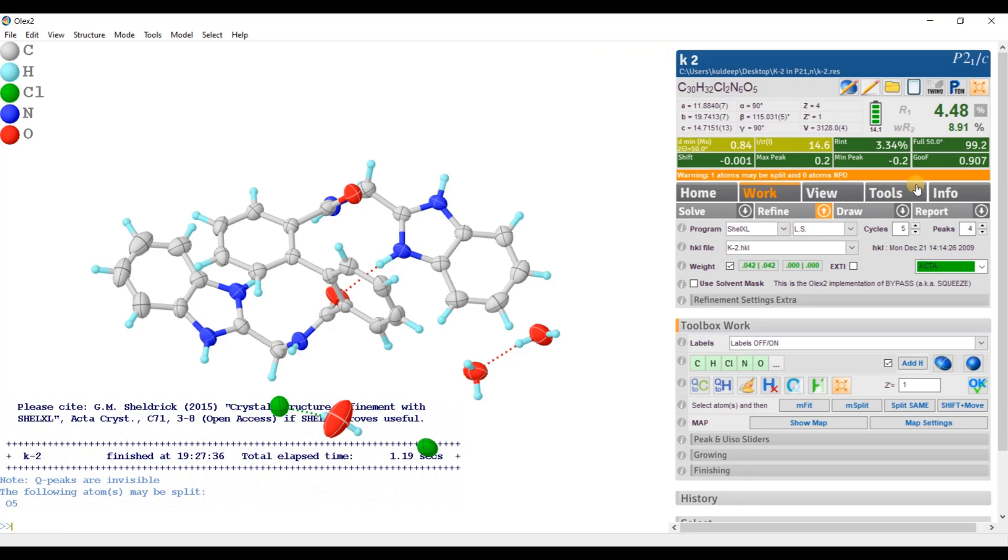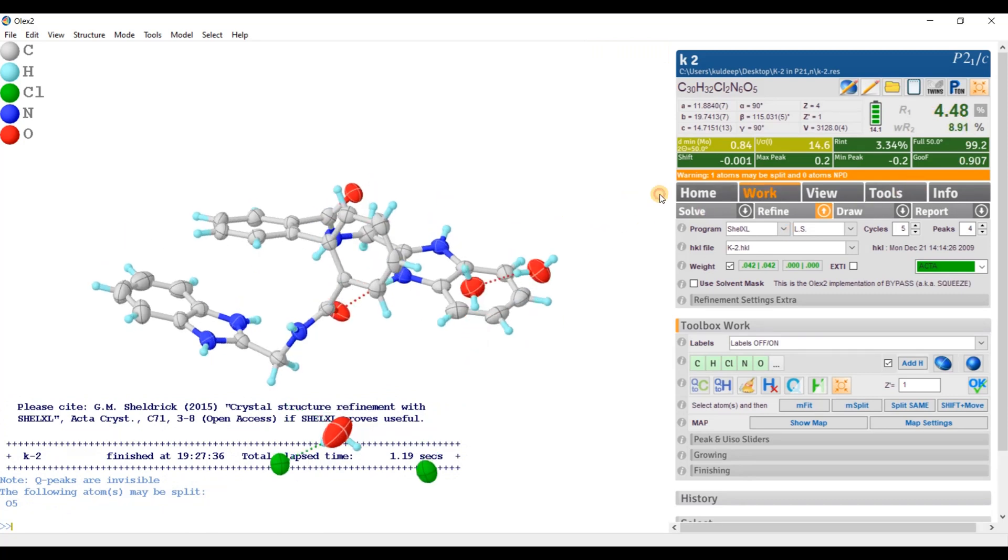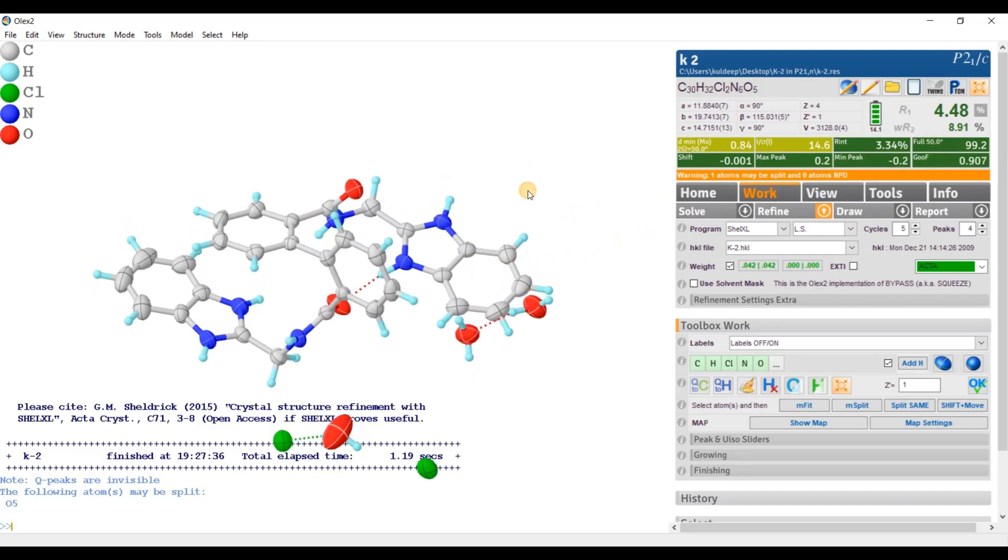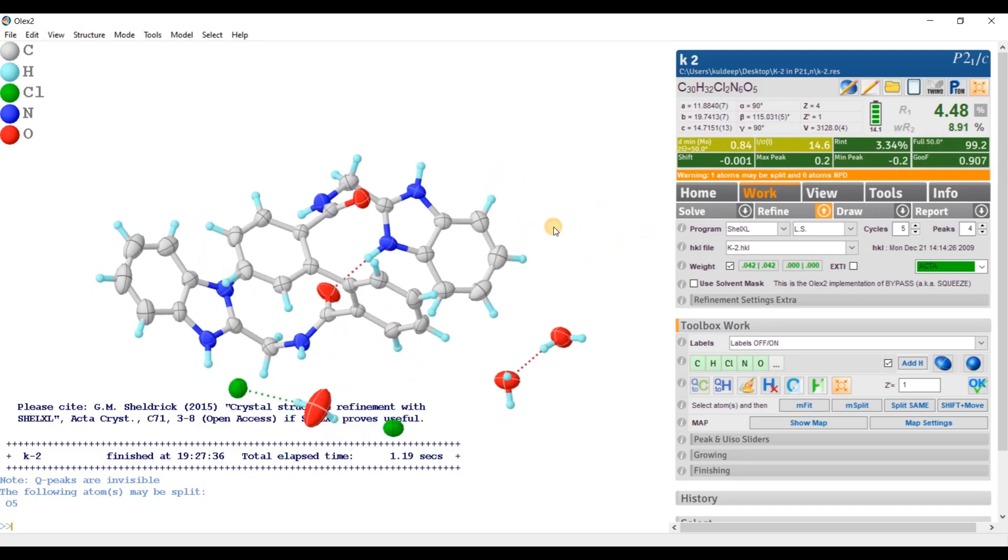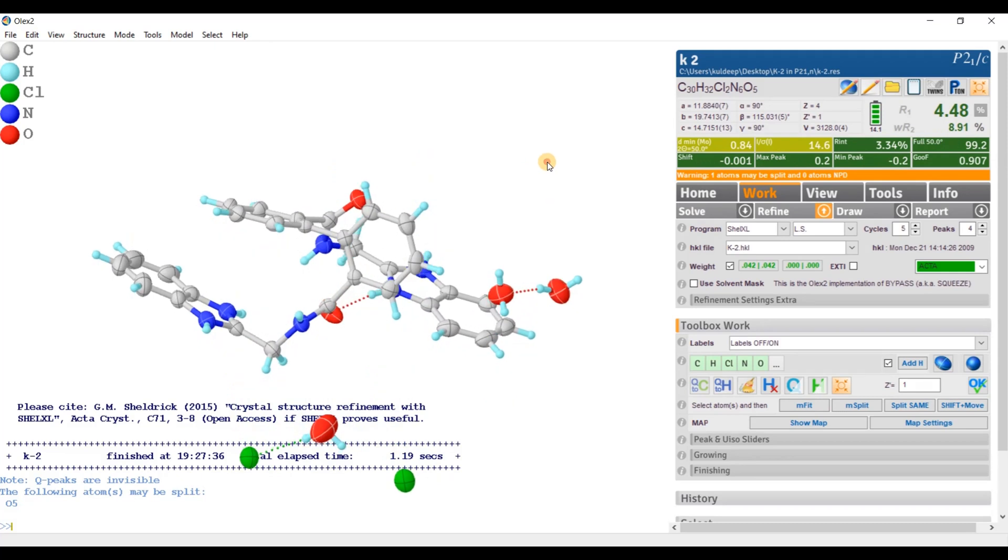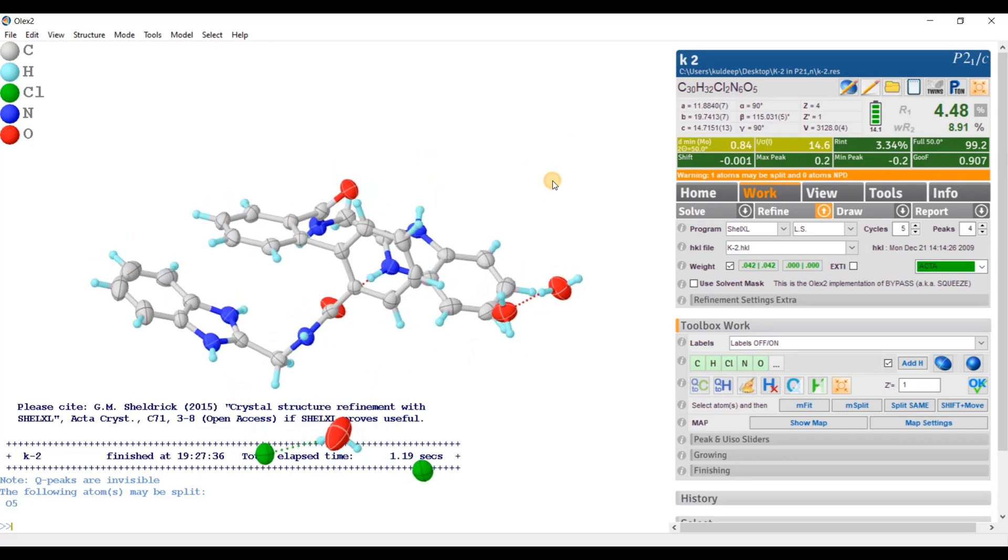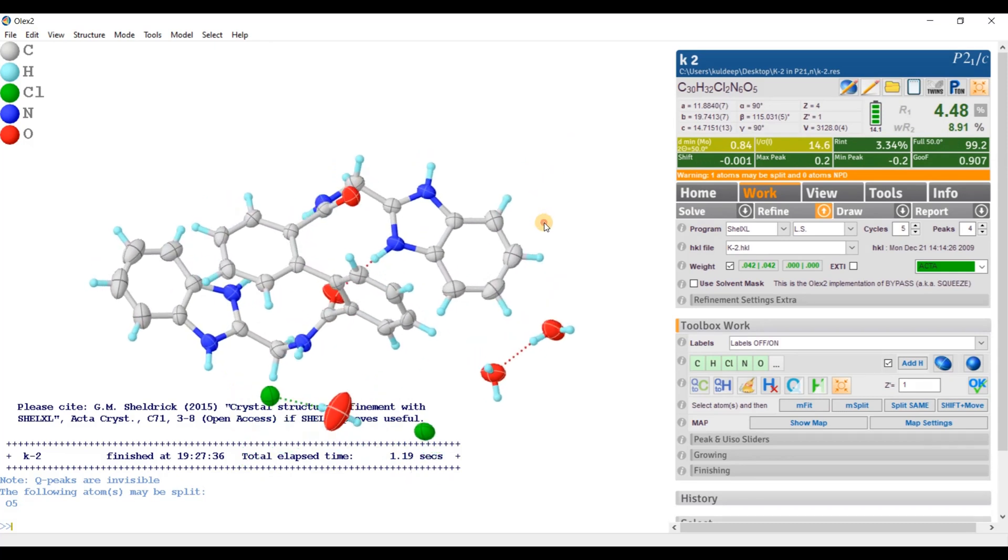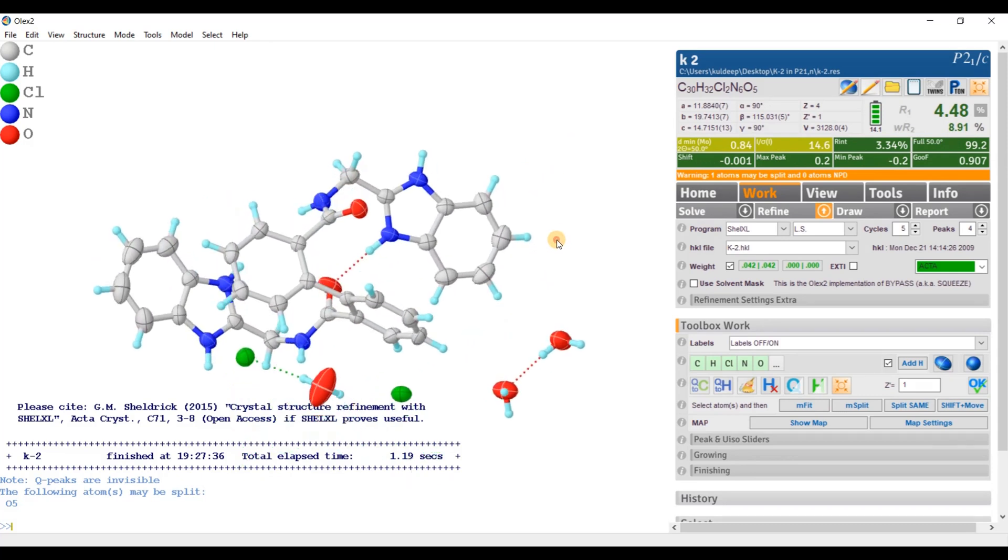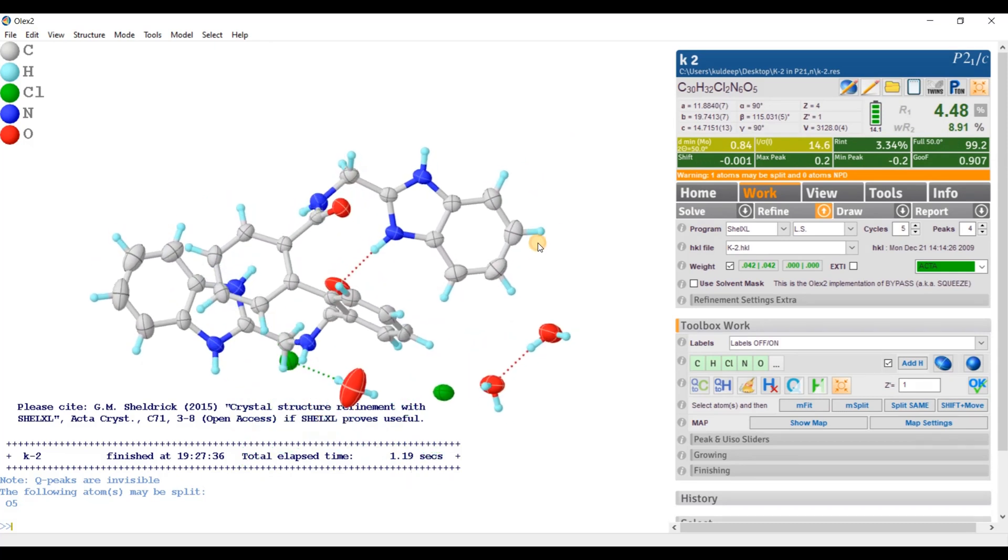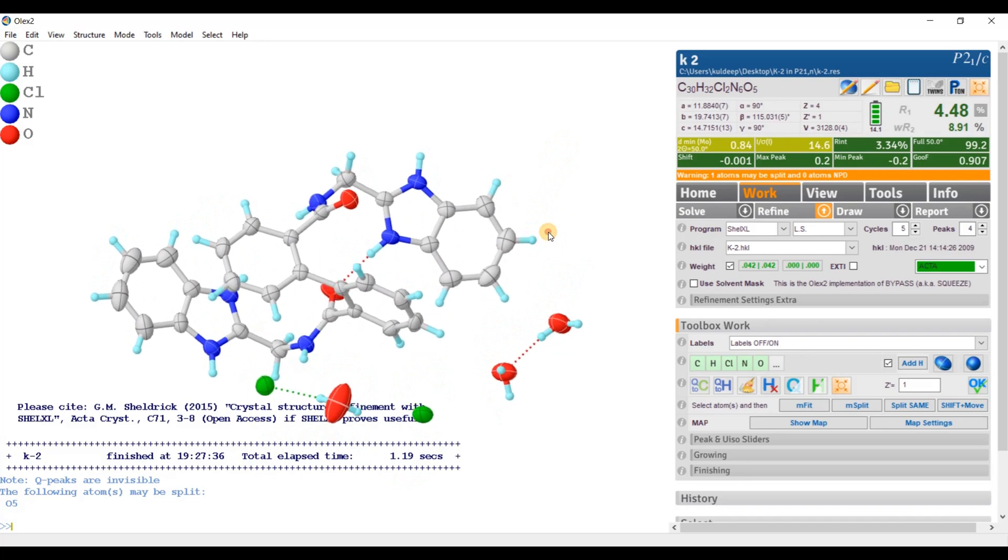So now R factor is around 4.48%. Everything stabilized and everything is looking nice. So in this way you can change the non-standard setting P21/n to P21/c.